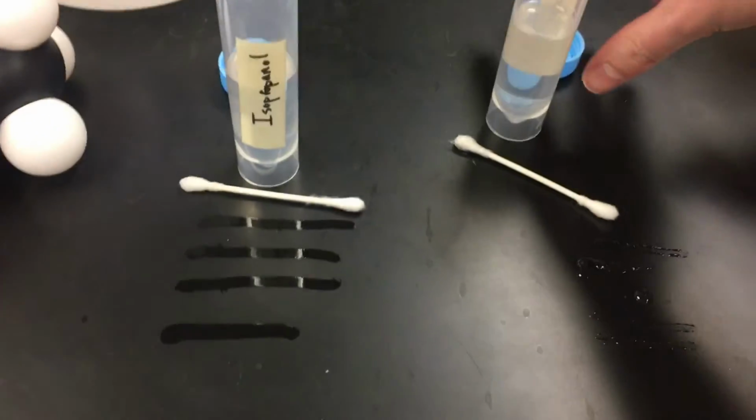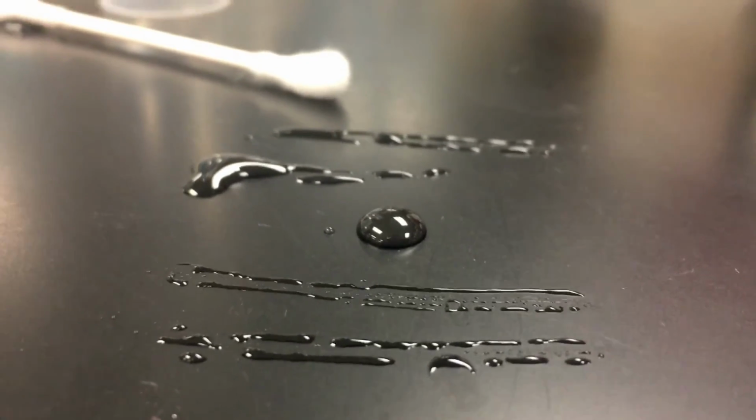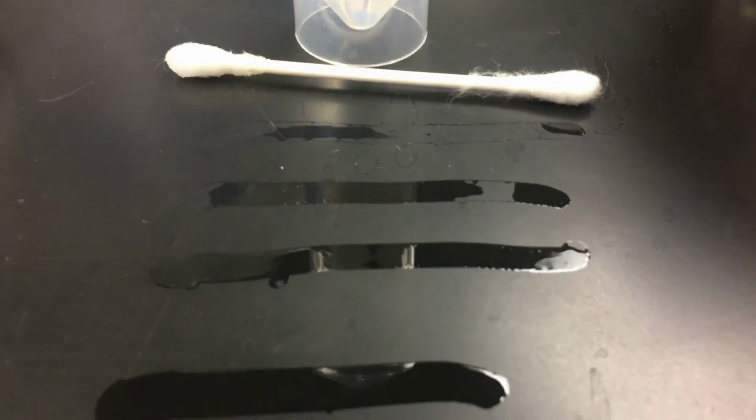I'm going to put the cap back on this so that I can really shake it. You can also see, like the ethanol, this is laying pretty flat, whereas this really bubbles up. There's a strong intermolecular force that causes a lot of surface tension here. Some of our rubbing alcohol has started to evaporate. It's going pretty fast.